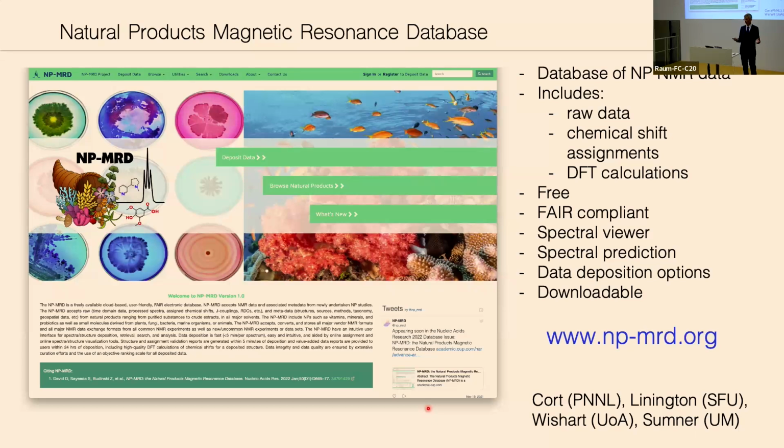And when you do read those files, they're probably coded with the code names from the lab book of whoever acquired the data, and whenever they did that. So it's effectively impossible to go back, even for people who have those disks in their storerooms. It would be really difficult to turn those disks into curated NMR data.